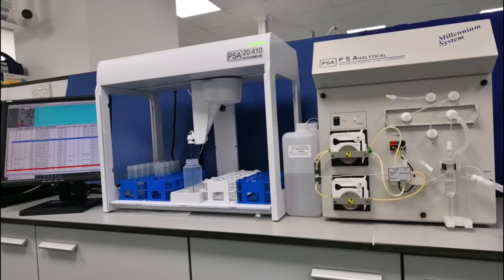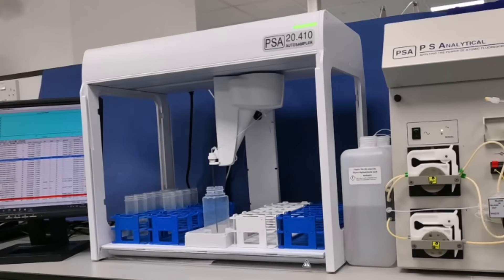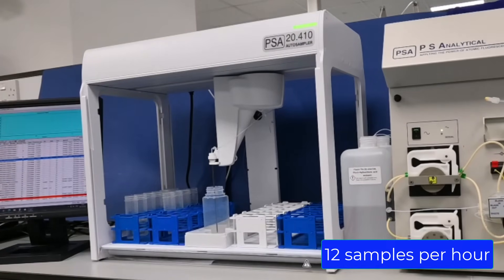The 10.035 is also used for other environmental applications around the globe. The system is fully automated using a 2410 autosampler and has the capability of analyzing 12 samples per hour.